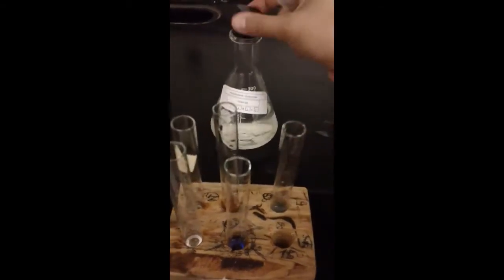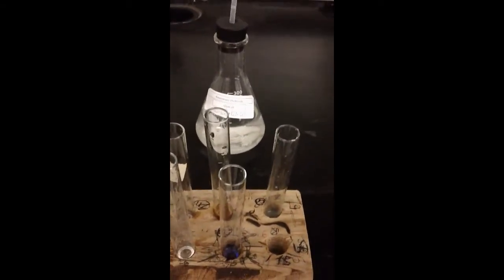Want to gently mix and note any changes. Okay, so I'm going to put this on the counter so we can do that.